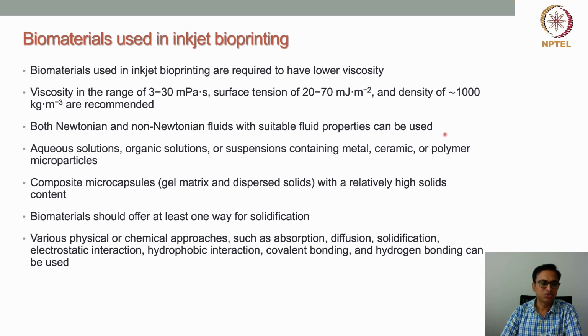Both Newtonian and non-Newtonian fluids, of course with suitable fluid properties, can be used. We can use different types of solutions and formulations with inkjet 3D printing technology.